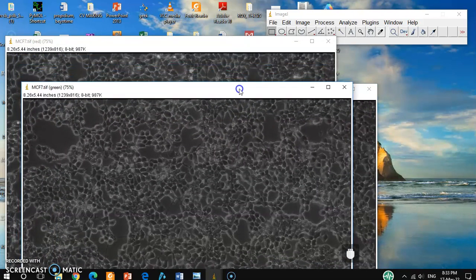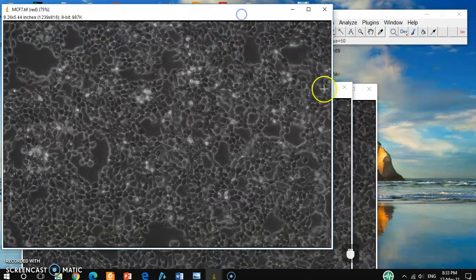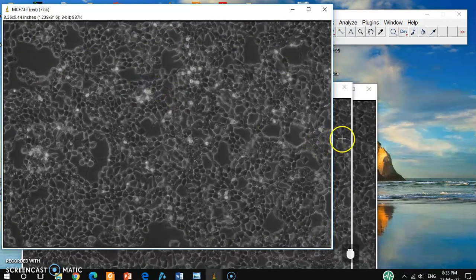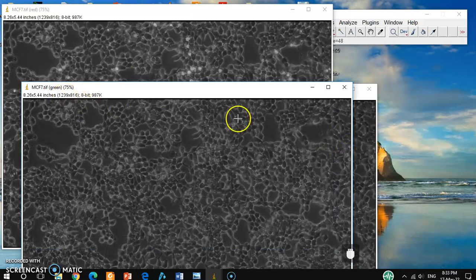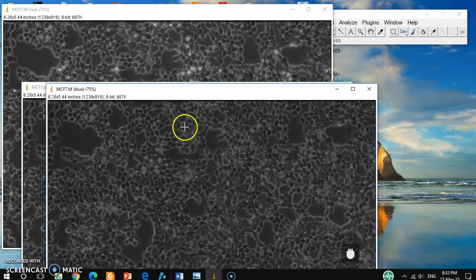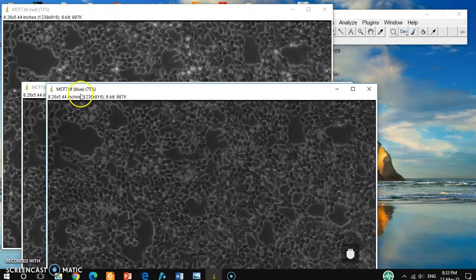And then you can see here the three different channels are separated. So this is the red channel, one is green channel, and another one is blue channel.